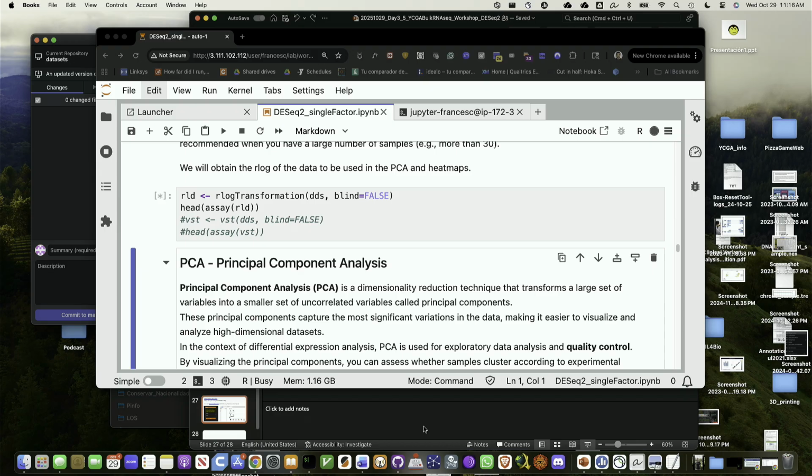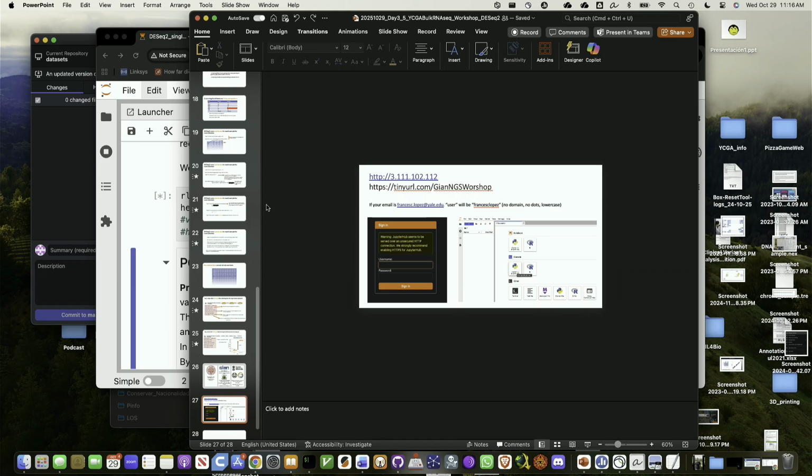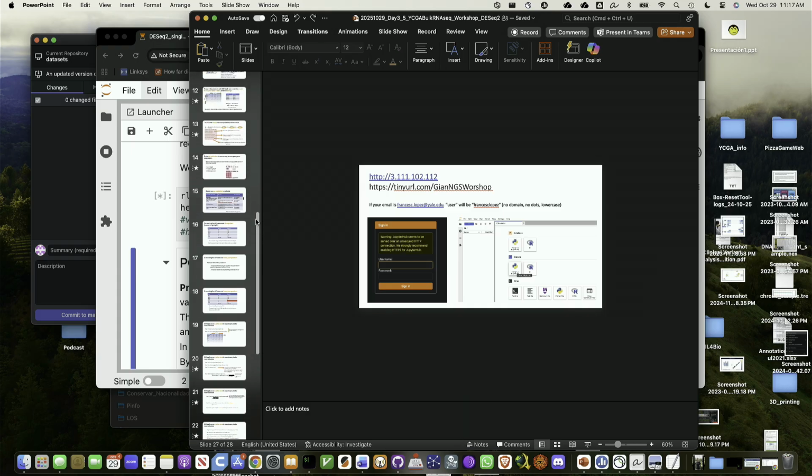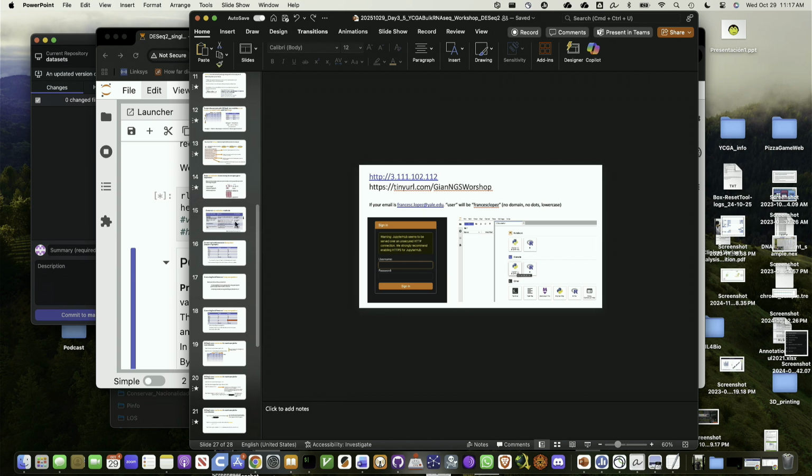I think he said that we are converting the outliers. Yeah, but I think he wants a more generic answer than the specific. He doesn't care about whether it's R-log or VST. You're talking about general transformation of data. People do all kinds of transformation. They have statistics and things like that. But why do we need to do that?